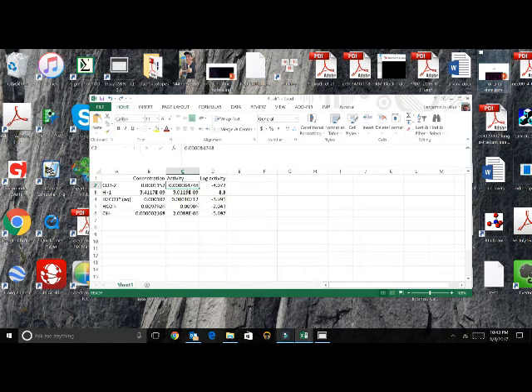And as we get to higher and higher pHs, you see the saturation index stays the same, because what's happened is it's precipitated increasingly. Column H here is the amount of aragonite precipitating. It's precipitating more and more until the aragonite KSP, the solubility product, or saturation index, and the ion activity product are equal, which means it's perfectly saturated.